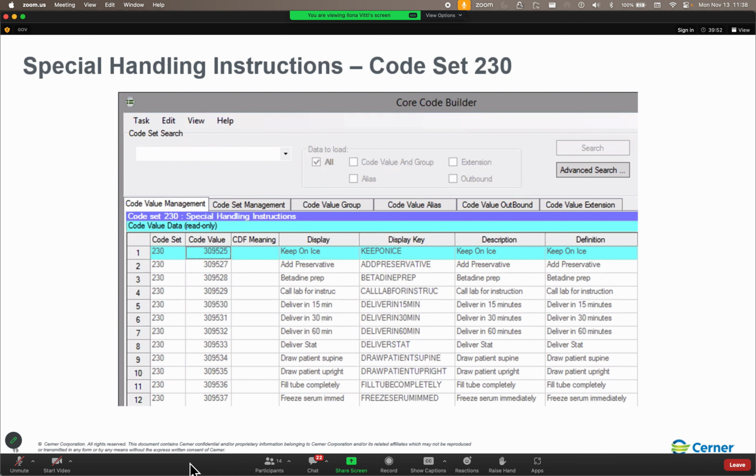Now, we'll then associate an accession class. Capillary would probably have a blood accession class, associated collection method. And then because Chem Auto subsection, Vitros 1 and Vitros 2 were defaulted to chemistry, chemistry's already been filled in for us on the top part. But on our safety net row down here, we've said, you know what?